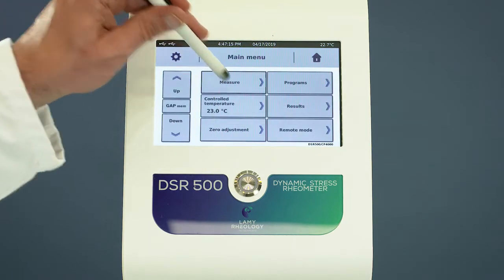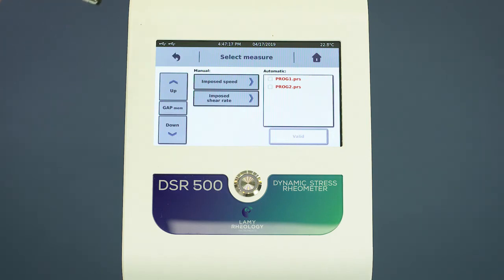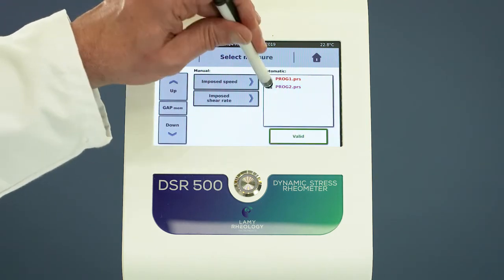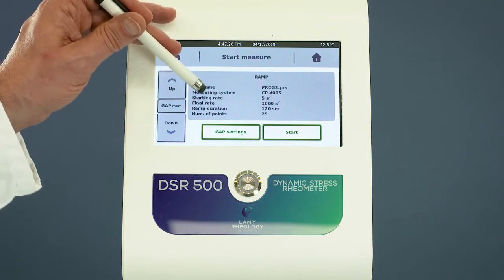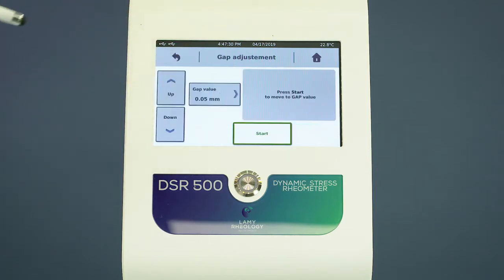Go to measure and select your method. The device shows you details of the program. Select gap settings.